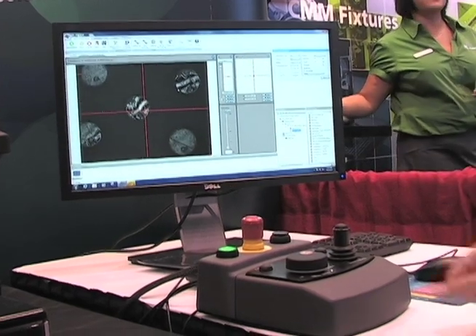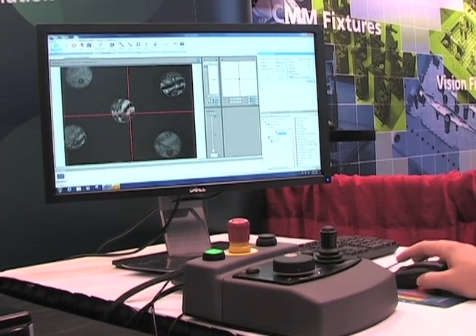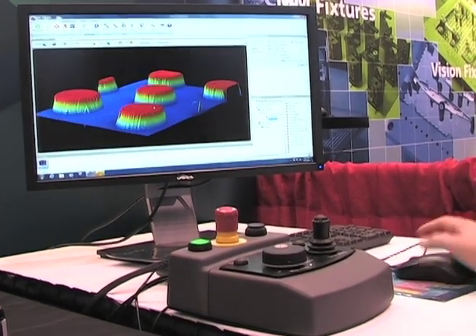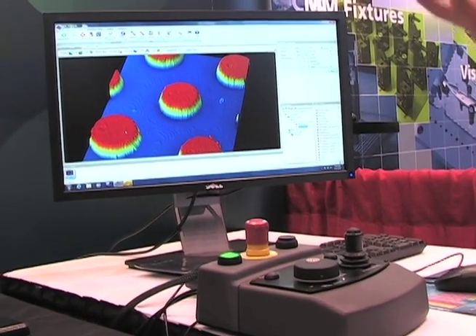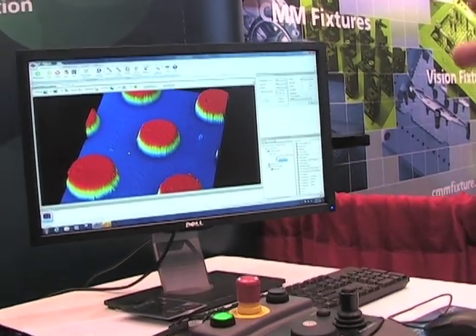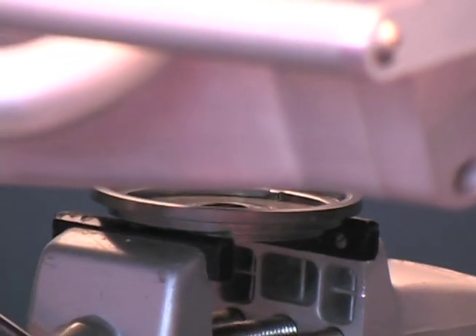I'm setting the focal plane height so that our sample of interest is in view, and then with one click we can make a measurement and scan through focus to acquire our data. We can quickly zoom in and view the same bumps at a variety of different magnifications. The nice thing about this technique is that we don't lose Z resolution as we change objectives — the Z resolution stays constant throughout the entire range of the instrument.